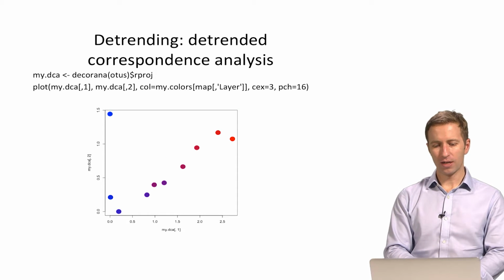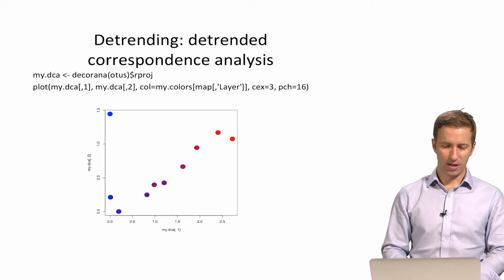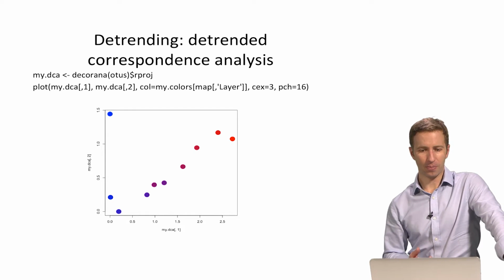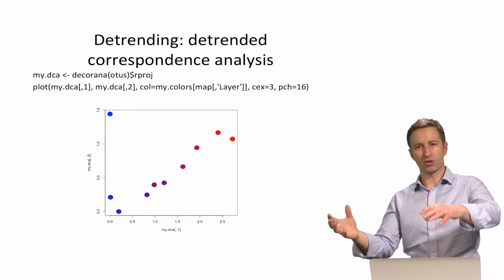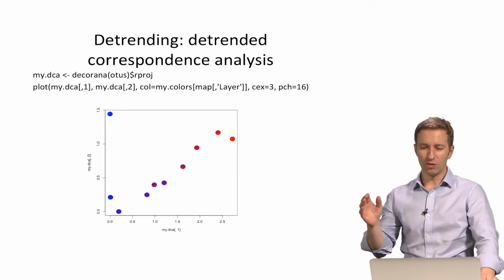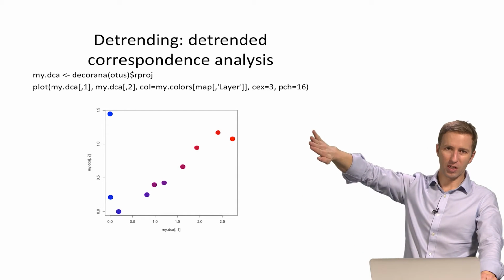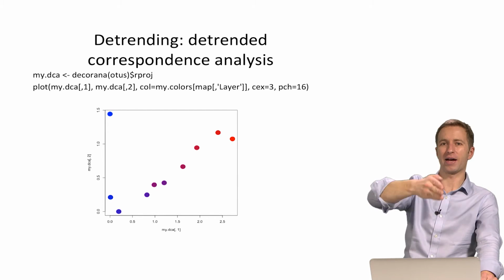Here's what happens if you run the detrended correspondence analysis in the vegan package in R, on the same Bray-Curtis arch. We're using that technique where it chops it up, and what happens is we get this weird effect where the whole beginning of the gradient gets shifted down and the whole end of the gradient gets shifted down together. Even though what you really want is to be following the gradient, more steeply at the beginning, and then leveling off and then curving back up with it.